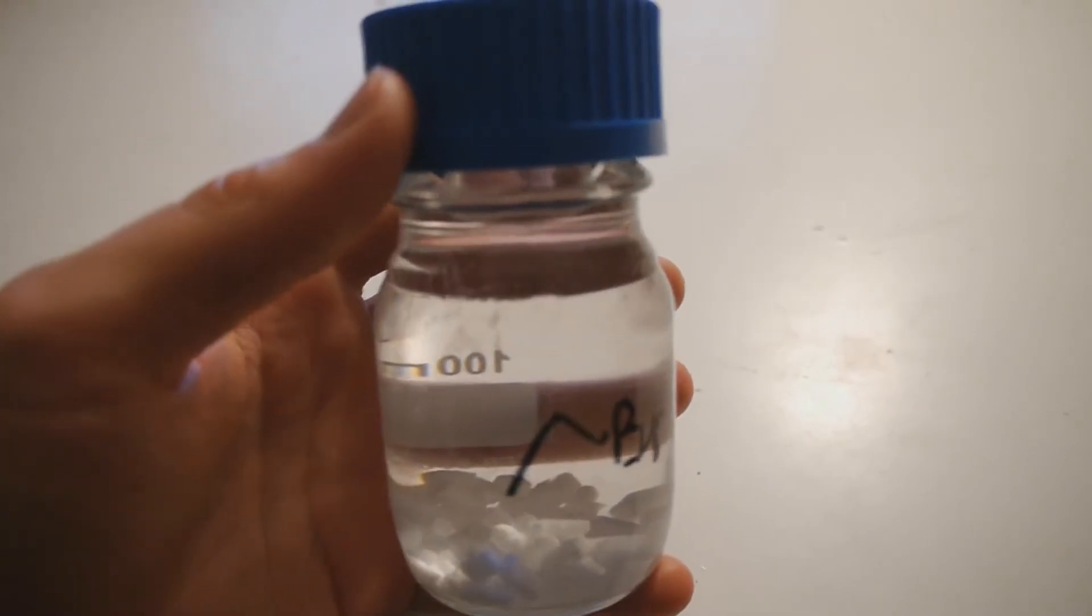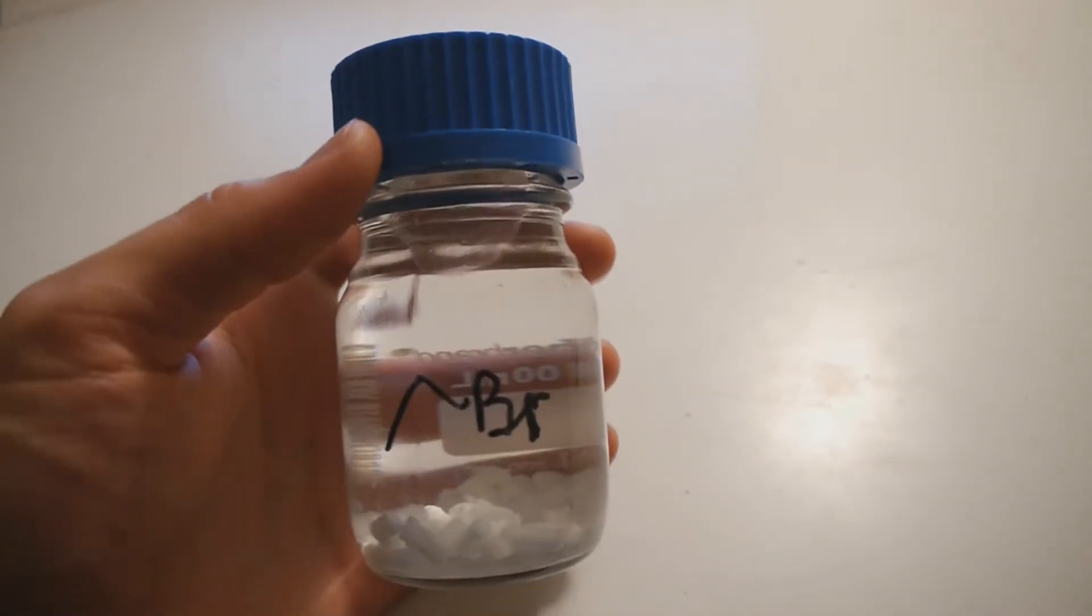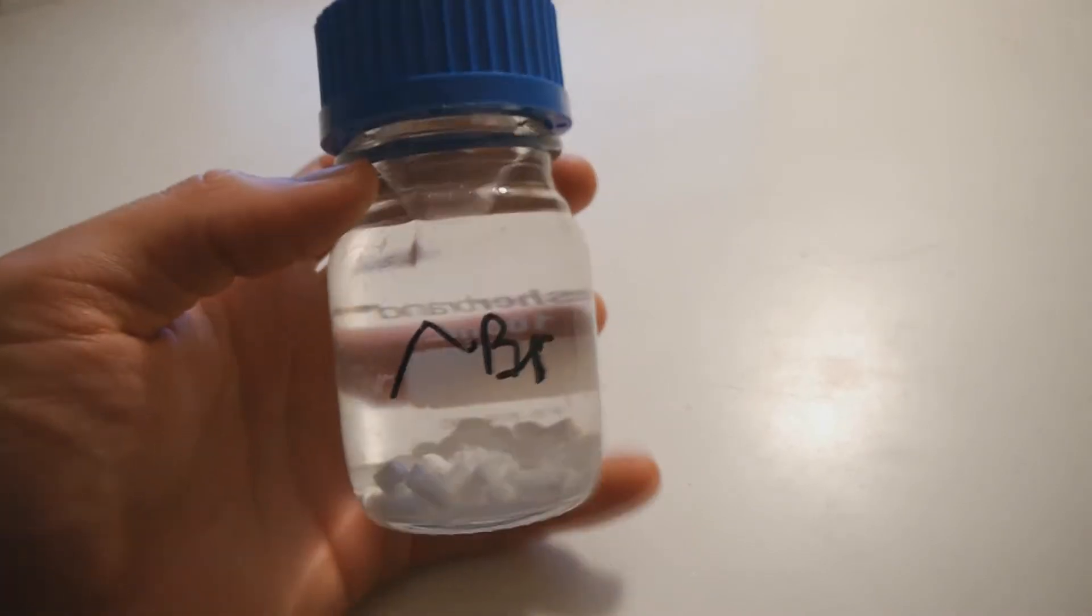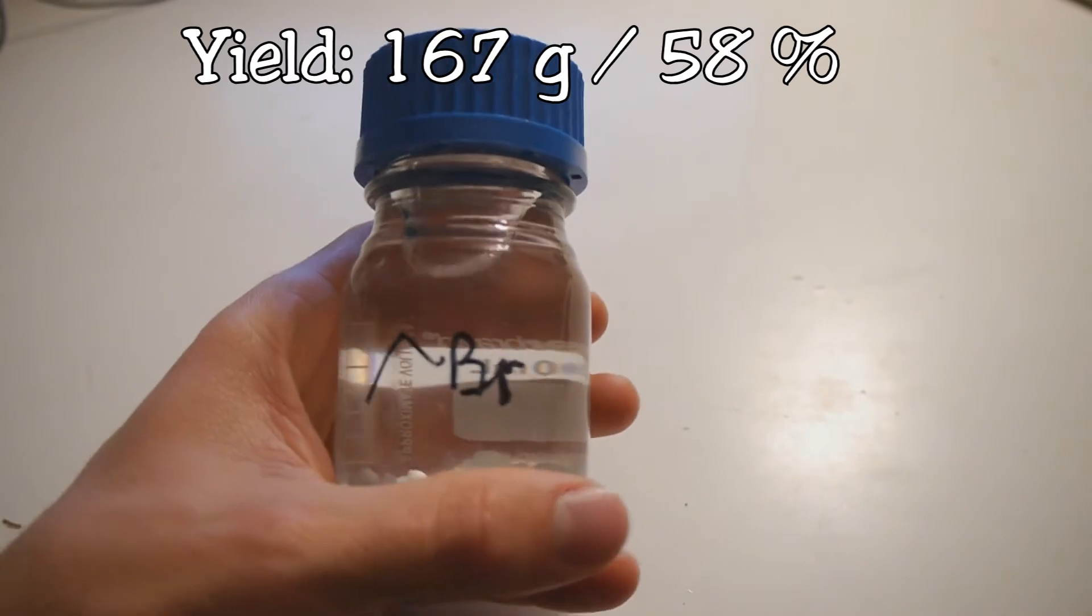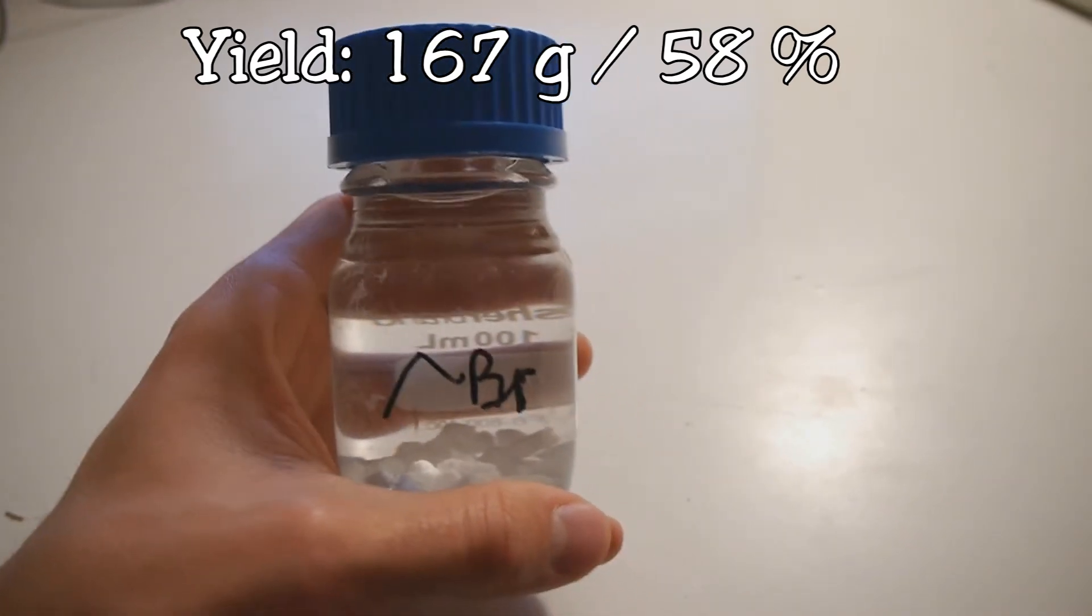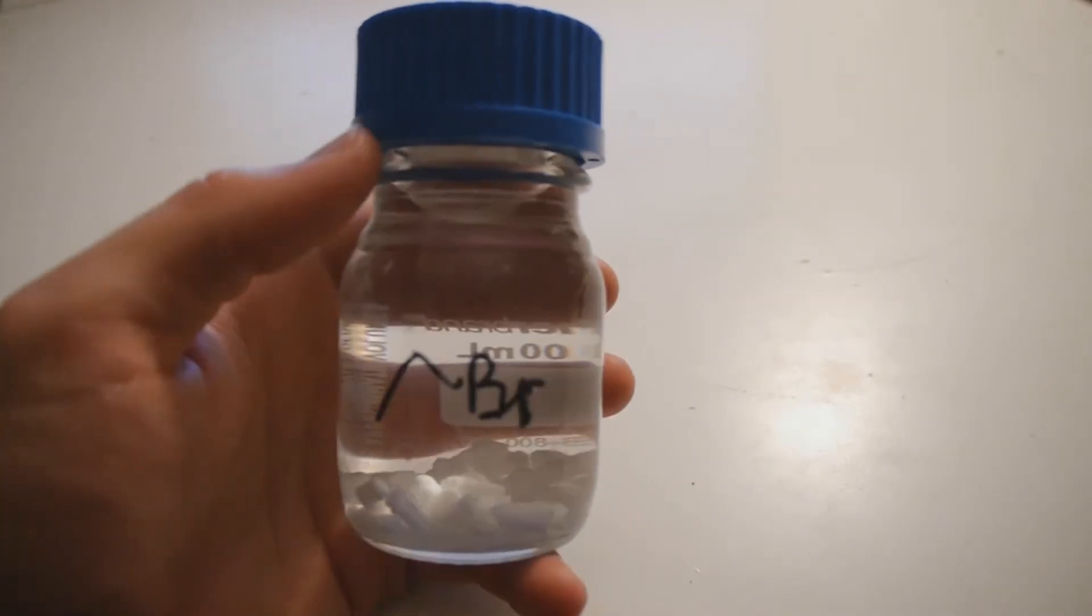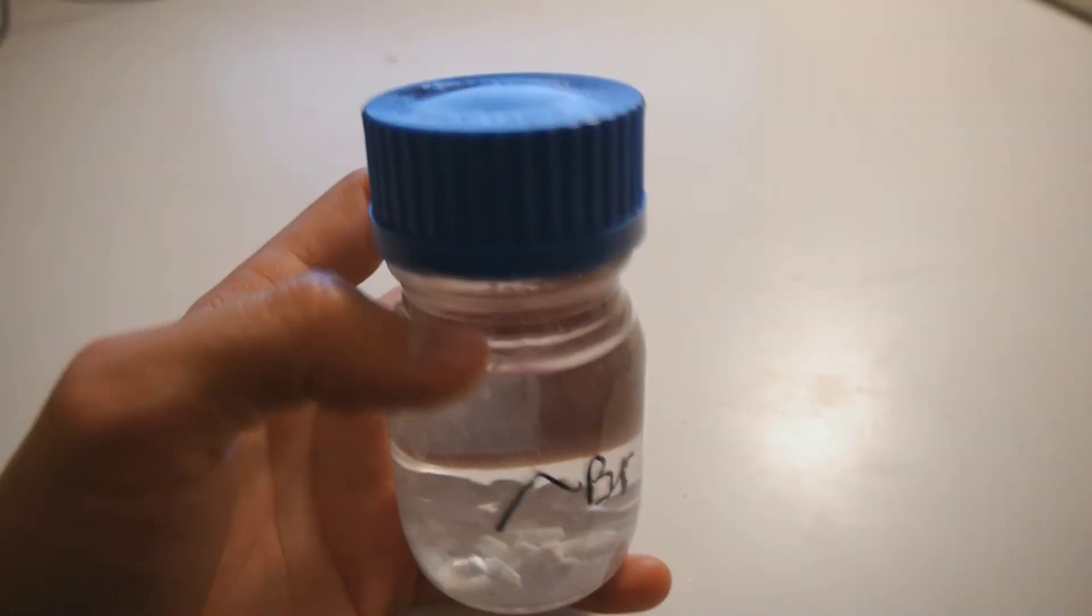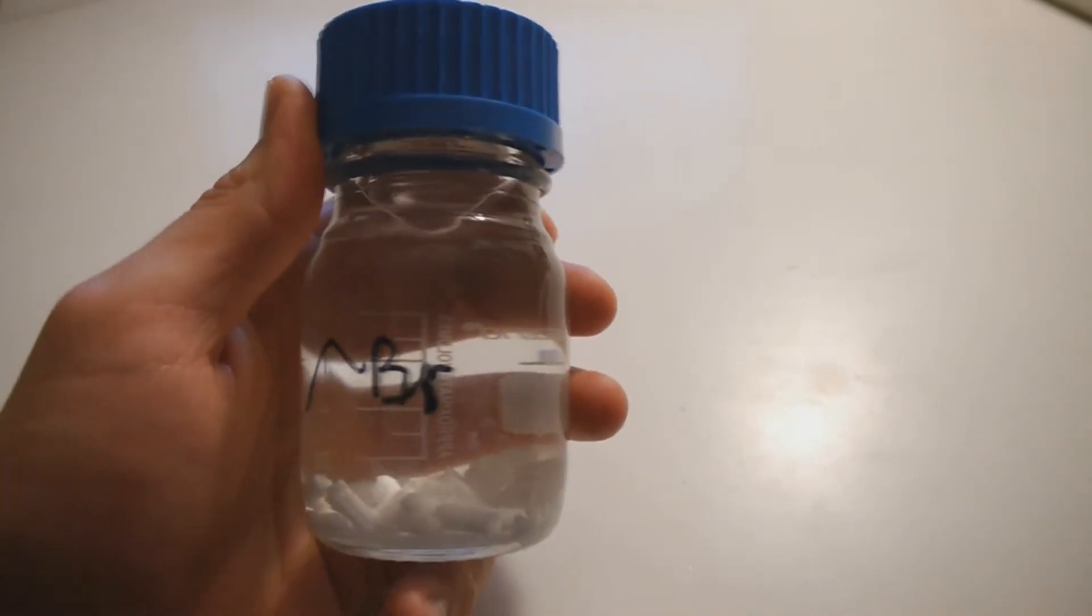So here's the final product of ethyl bromide. After having dried properly, the solution has now cleared up nicely. And this is about 167 grams, which corresponds to a yield of 58 percent, assuming my original assumption on the weight of sodium bromide is correct. But that could be totally off. You may have to take that yield with a grain of salt, the percent yield at least.